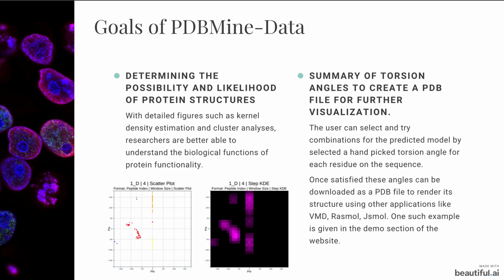There are many goals of PDBMine-Data, one of the most important being determining the possibility and likelihood of protein structures. With detailed figures such as kernel density estimation and cluster analysis as shown below, researchers are better able to understand the biological functions of protein functionality.